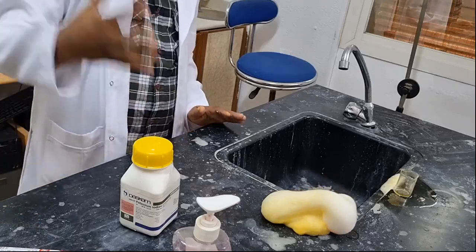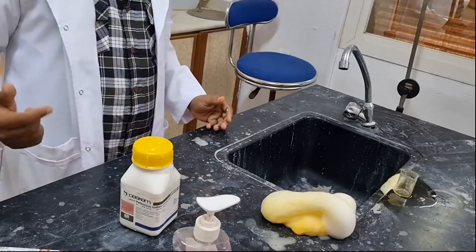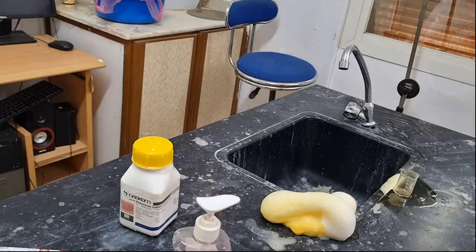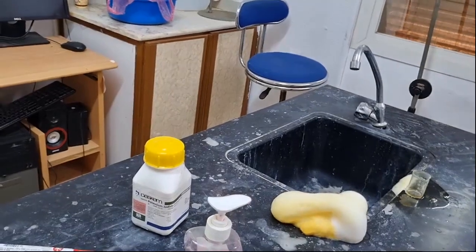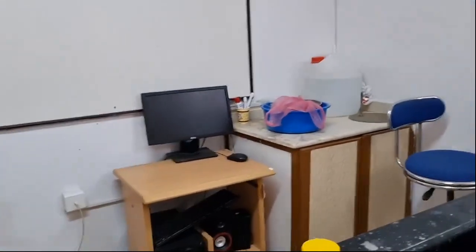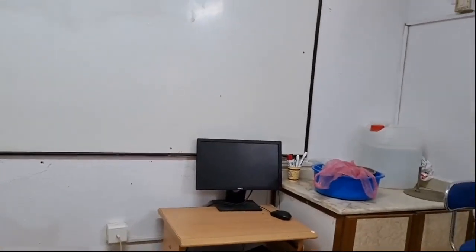Decomposition means a single substance will be decomposed into other new, simpler substances. That means the hydrogen peroxide is decomposed into two different substances called water and oxygen. As you see the equation, the theoretical part, you can observe right here.